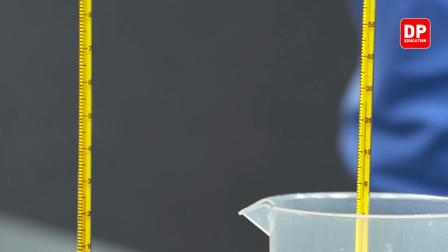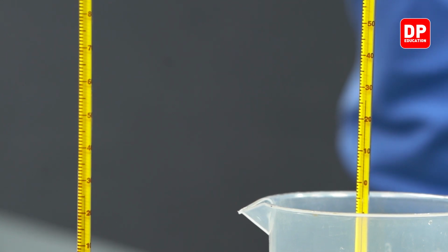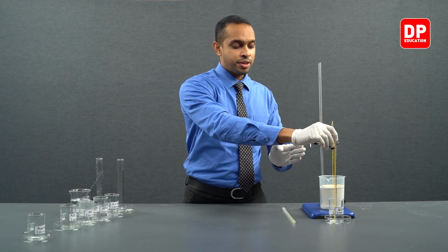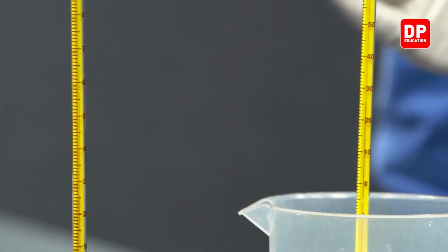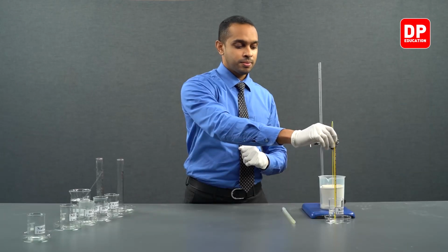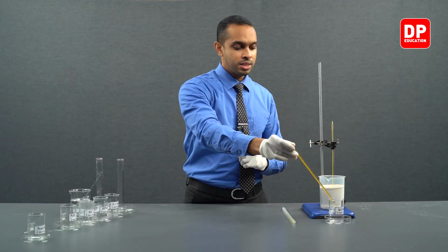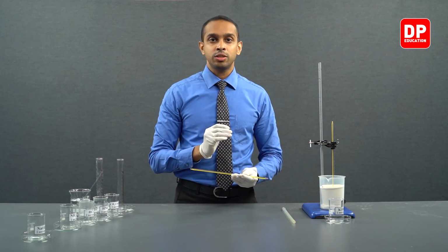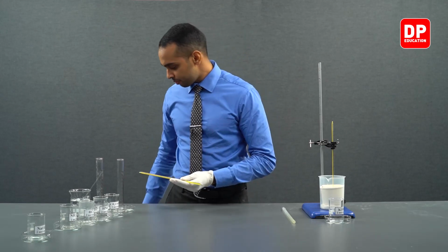As you can see, the temperature of the acid is at 26 degrees Celsius and the temperature of the base is at 25 degrees Celsius. After recording the temperatures, we can now move on to measuring 50 milliliters of our base.